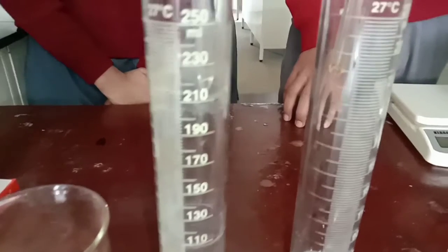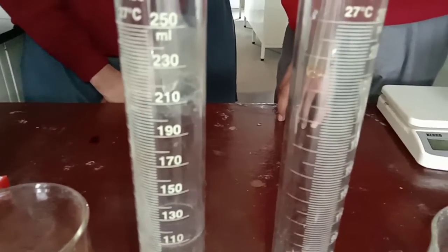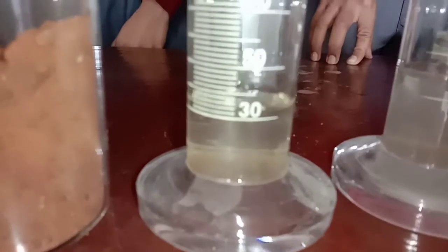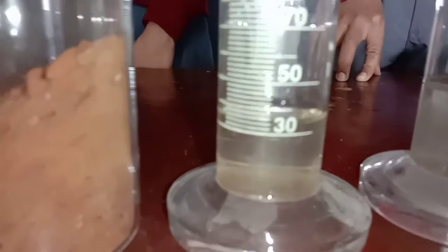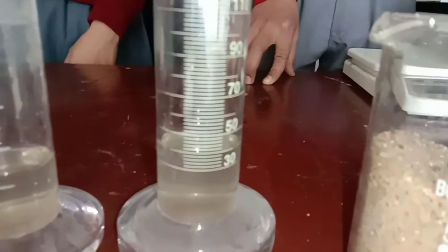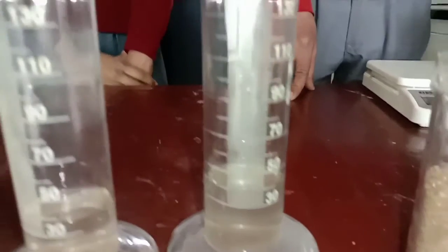Like this, we can calculate the water holding capacity of the soil in percentage. For this, we have to subtract the volume of water collected, that is 30 milliliter for clay soil and 40 milliliter for the sandy soil, from the volume of water poured, that is 50 milliliter of water, divided by the weight of soil in gram, that was 25 grams, into 100. After calculating this, we'll get the water holding capacity of the soil in percentage.